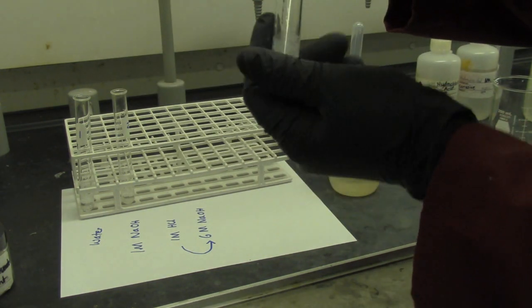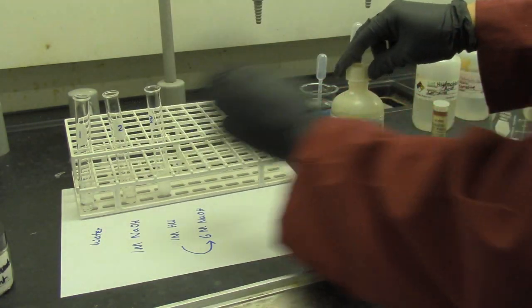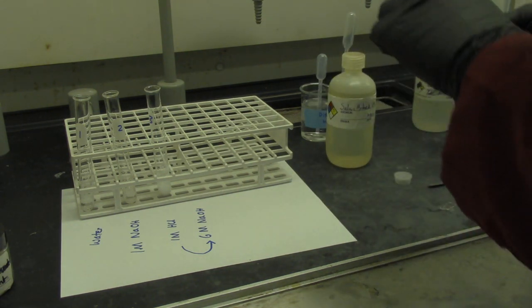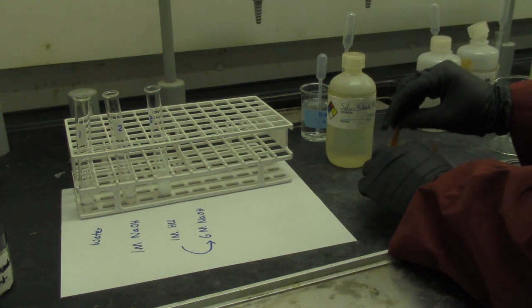Take down the observation. Again, we will test the pH of the solution using the litmus paper.